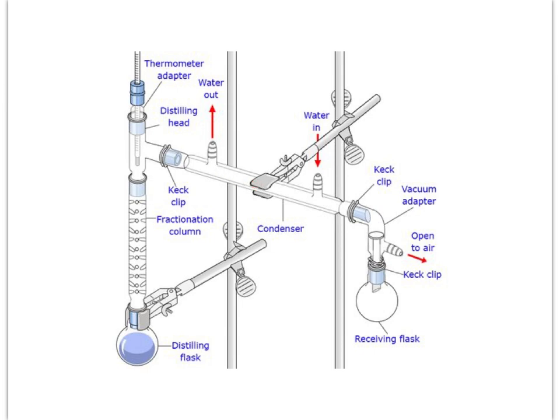Then you will put on your condenser, right? And all of this is in the hood. So we will set this up in the hood, because there is a water source in the hood. Again, grease and clamp. With a second ring stand, clamp your condenser in the middle to hold it steady.